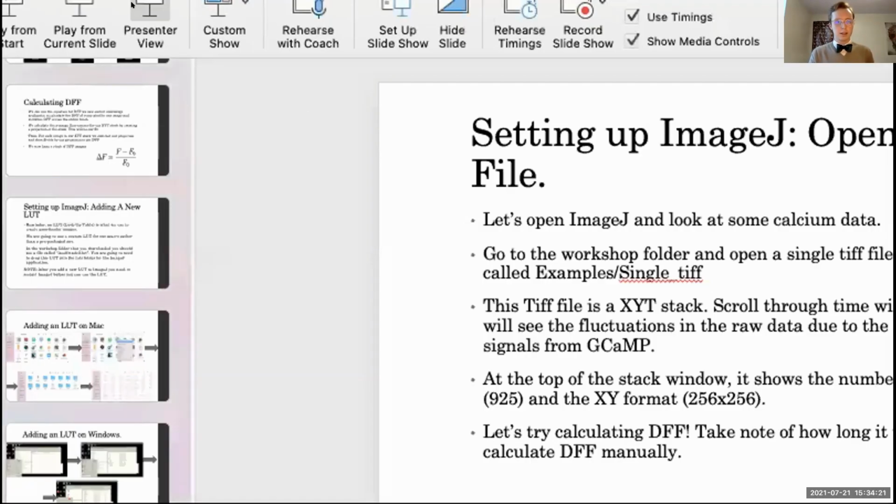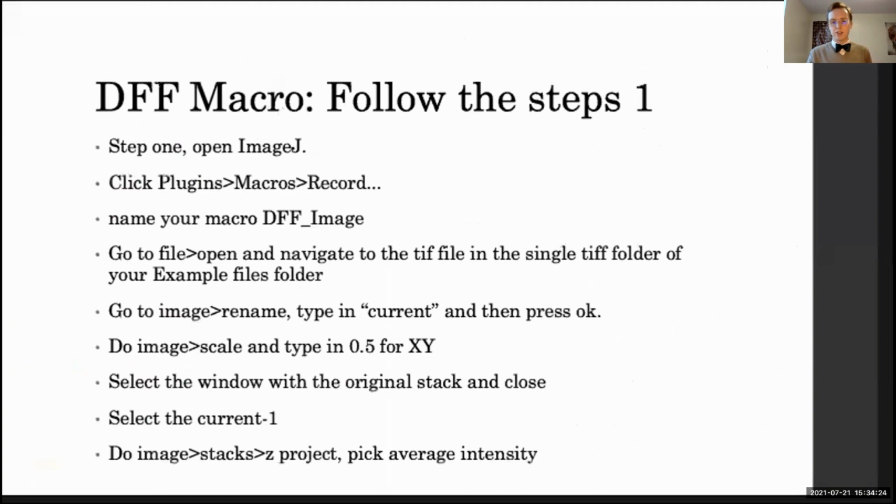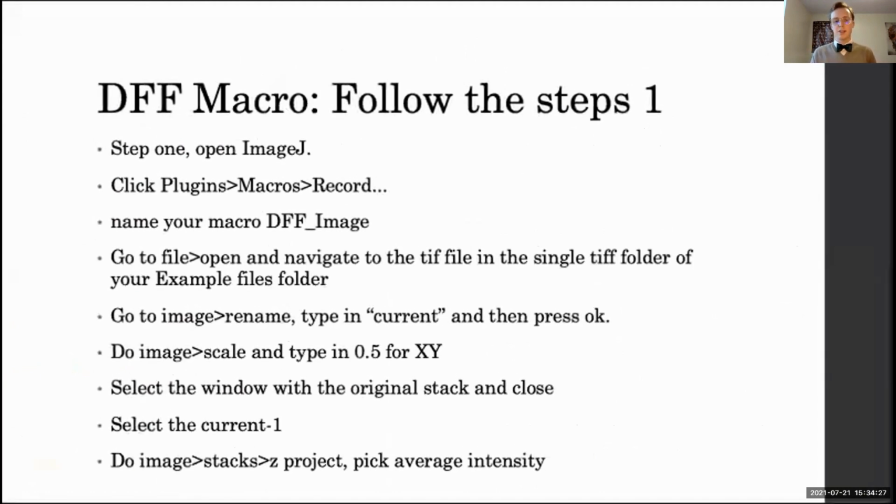I'll give about 3 minutes for this first page here. And then I will switch over to the second page. Please let me know if you get stuck anywhere or if you have any questions. All right, I'm going to switch over to the second page now, and we're going to give this one about 6 minutes.